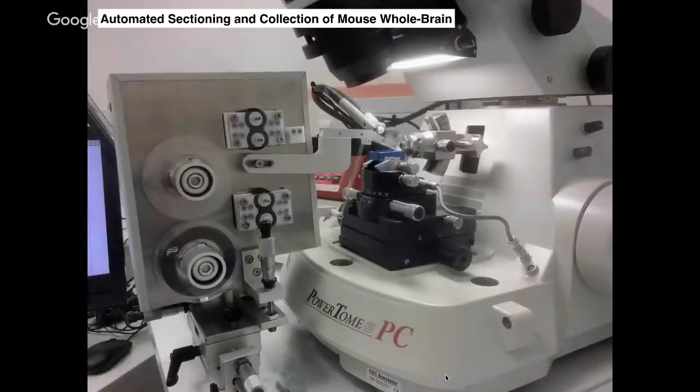So with regard to, now that we have a brain, we want to be able to cut it up and image it using high throughput EM. There are different ways we can go. I mentioned 3 previously. FIB-SEM is ruled out because of the limited depth that you can actually mill away before problems occur, which is limited to, I think, 100 microns or less. And so that left the serial block face approach and the serial sectioning approach.